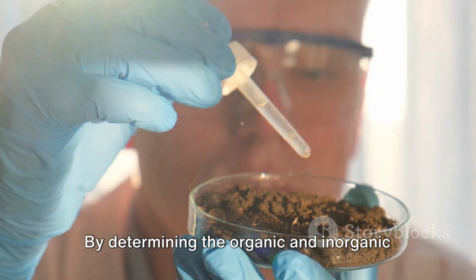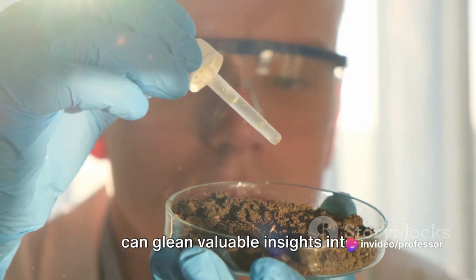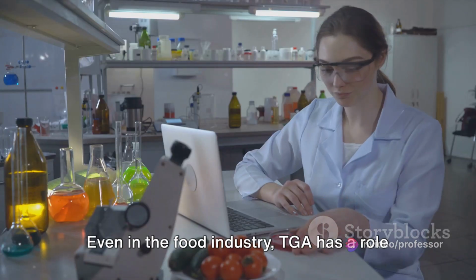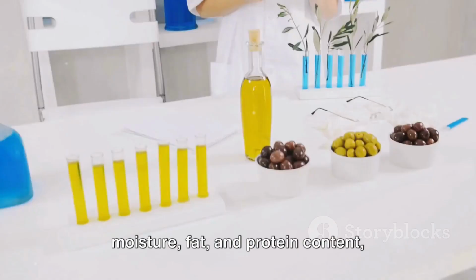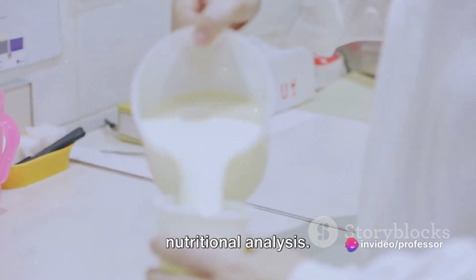By determining the organic and inorganic composition of these samples, researchers can glean valuable insights into environmental changes and impacts. Even in the food industry, TGA has a role to play. It can analyze food products for moisture, fat, and protein content, contributing to quality control and nutritional analysis.